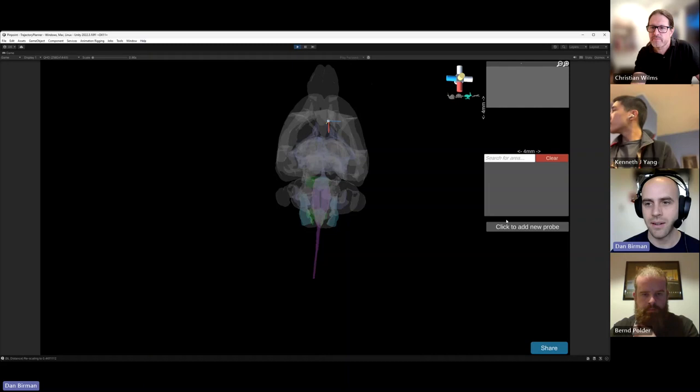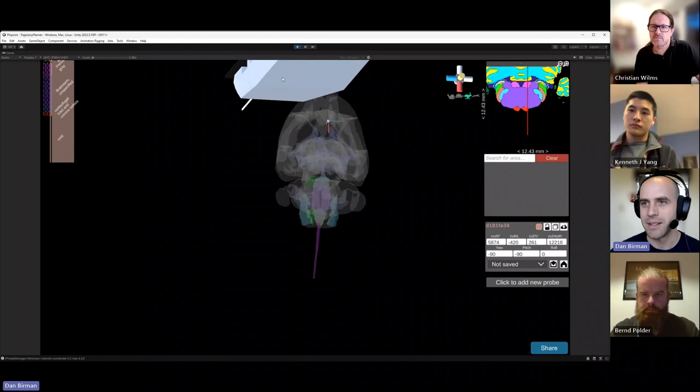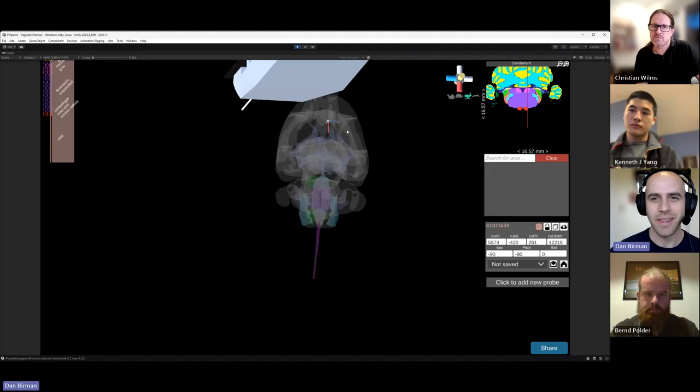This is the rat atlas. We can drop probes in the scene and drive them into the atlas. It looks like there's a bug somewhere here, so there are some improvements that need to be made, but it's there and it'll be working soon. Whatever bug is going on with the position of the probes will be fixed by the time you actually interface with this.